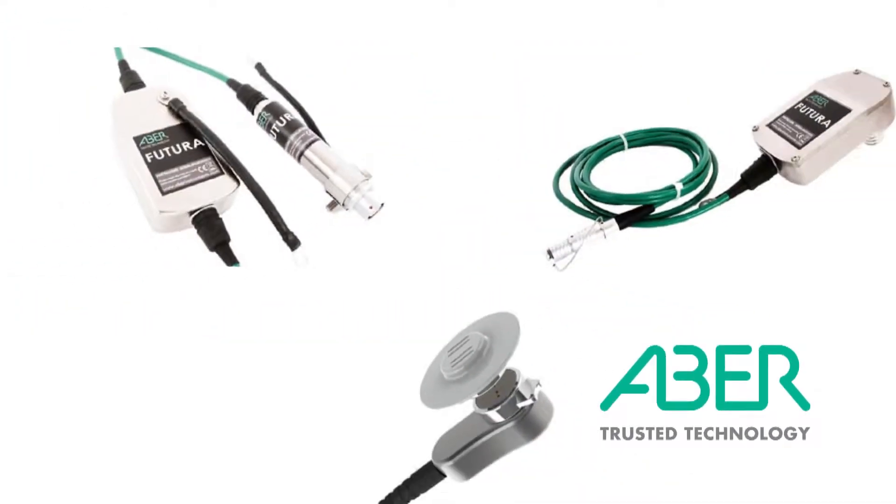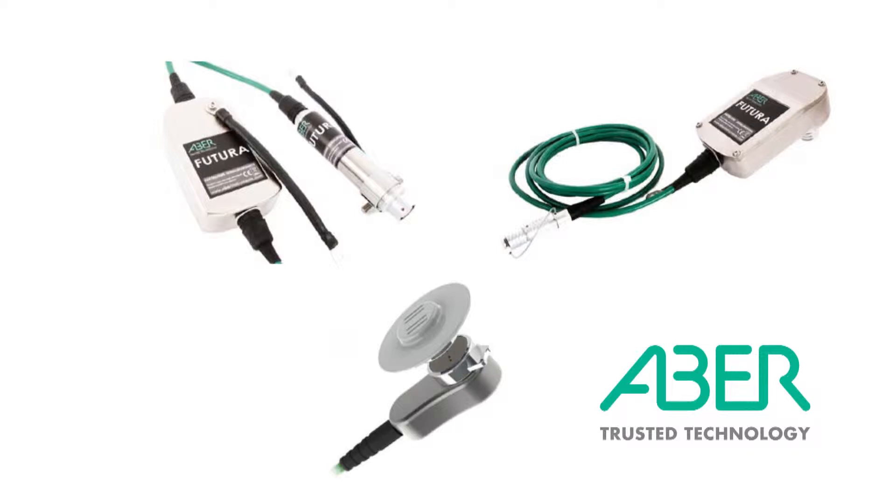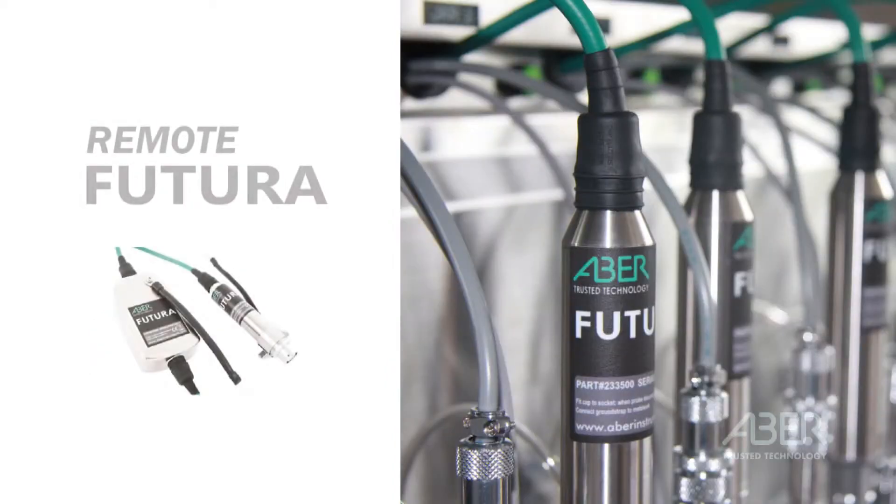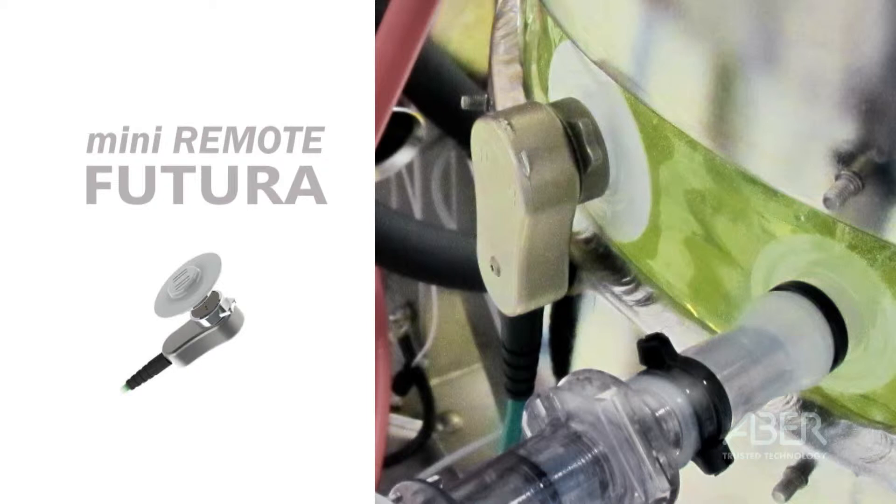The Futura range comprises three distinct configurations tailored to suit your bioreactor type. The standard Futura is designed to work with large bioreactors. The Slim Remote Futura is designed for use with smaller bioreactors or on vessels where headplate space is restricted. The Mini Remote Futura is designed for connection to disposable single-use bioreactors.